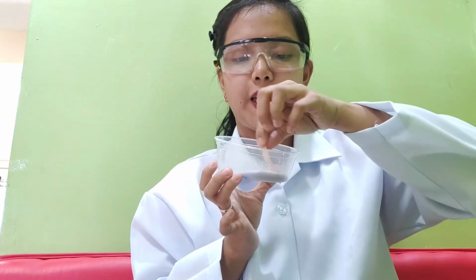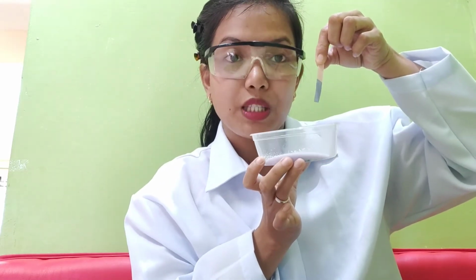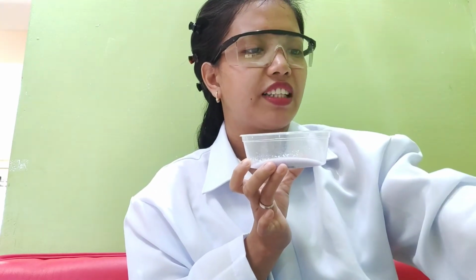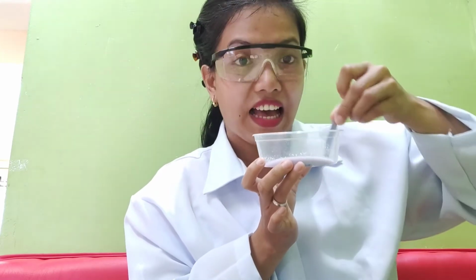Okay, so let us try if this liquid soap is an example of an acid or a base. First, we will use a red litmus paper. Okay, you can see the red litmus paper turns into blue. How about the blue one? Let us try. And the blue litmus paper stays blue. So a soap, or a liquid soap, is an example of a base.